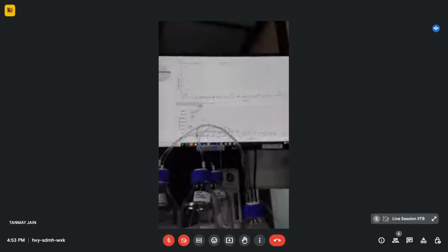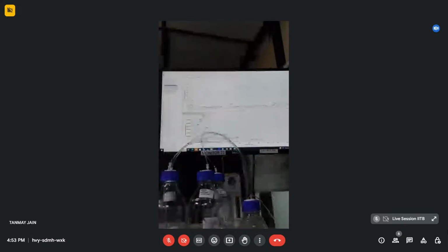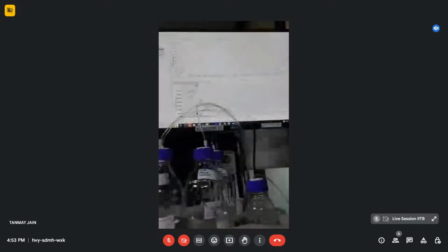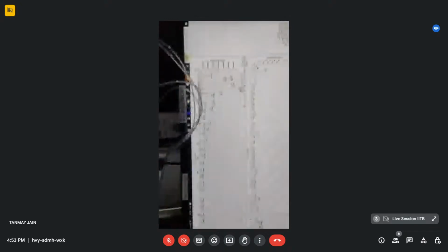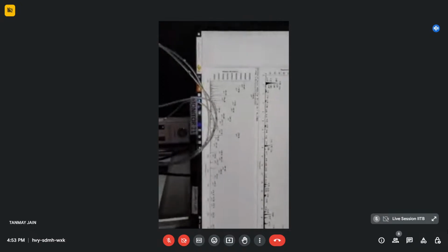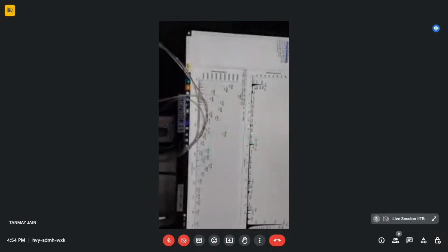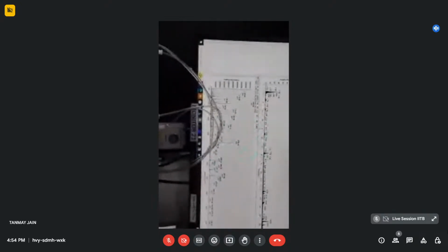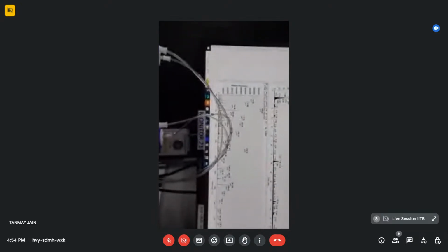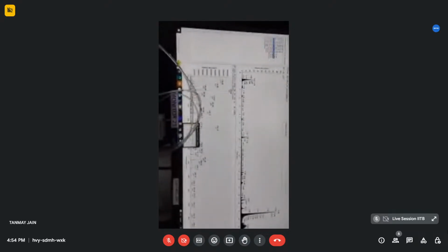So you can see that here the m/z values have been identified, where the mass is and the charge. For example, here you can see that the charge is in the +1 state and the m/z is 202.02. Now, after understanding all this at the MS1 level, when we go to the MS2 level and see the fragmentation pattern, the fragment at 202 will give separate smaller fragments, and from the fragmentation pattern we can understand which particular metabolite it is.